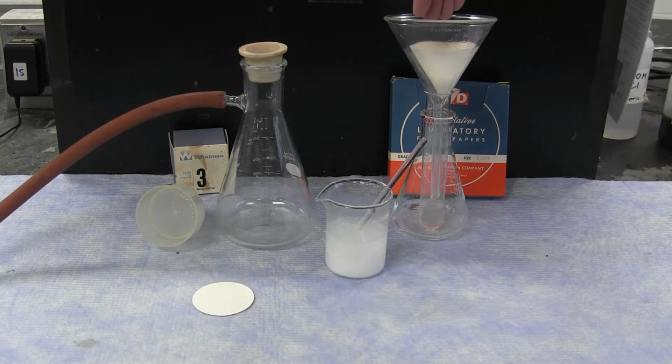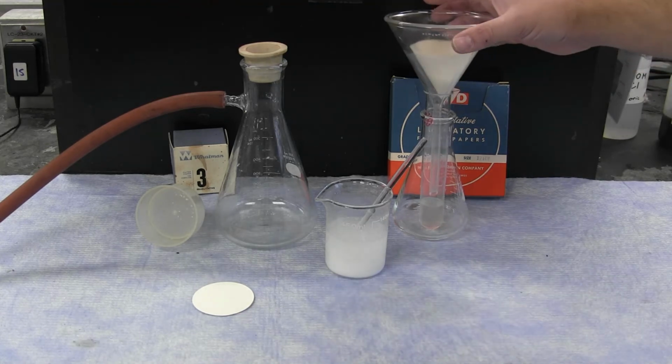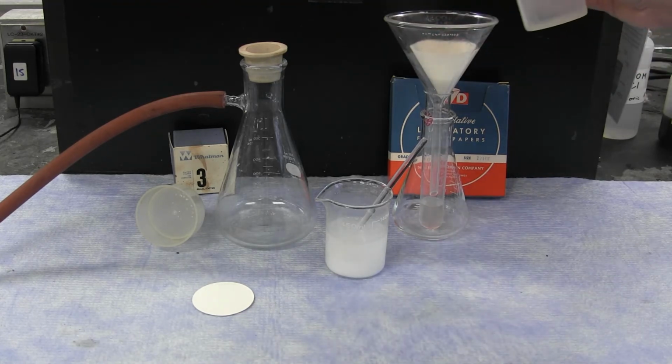Likewise, the precipitate on top could also be analyzed, and in future laboratory courses, the precipitate on top may also need to be washed with water to make sure all of the liquid is gone and only the clean solid remains on top.